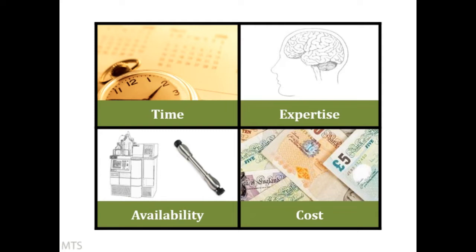And it might not just be now when you're developing the method, but it might also be when you're running the method in routine use. So you might want to find a simple strategy for, say, sample preparation that is very quick and easy to do, compared to something that is more complex and has a cost associated with it.